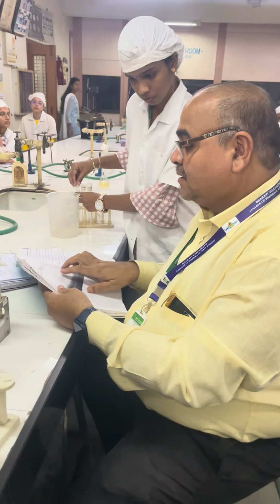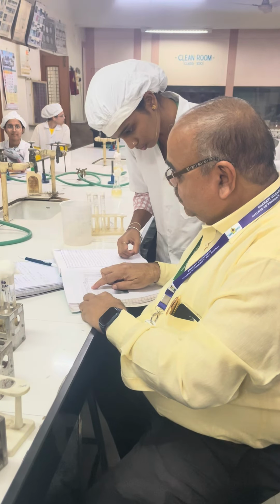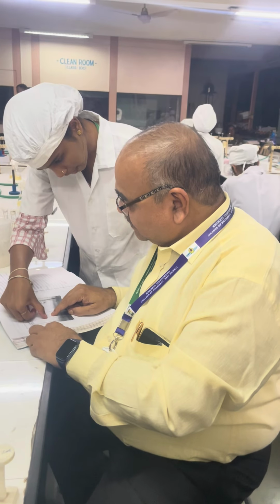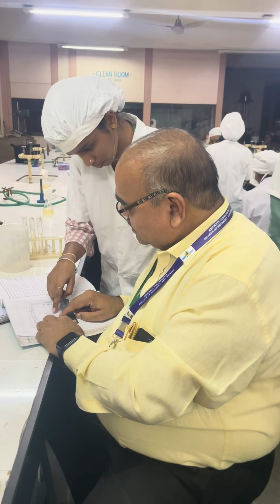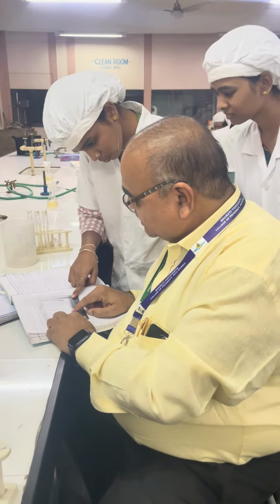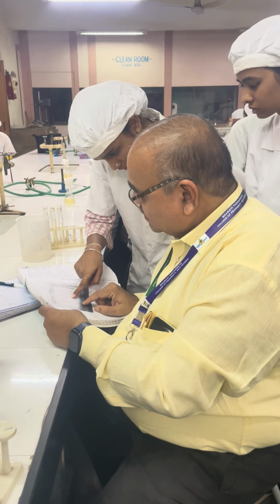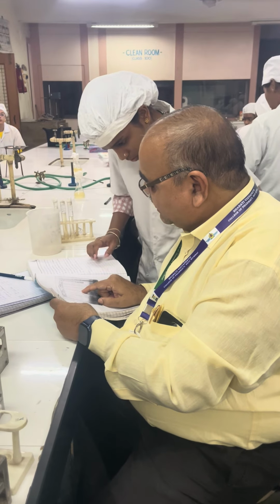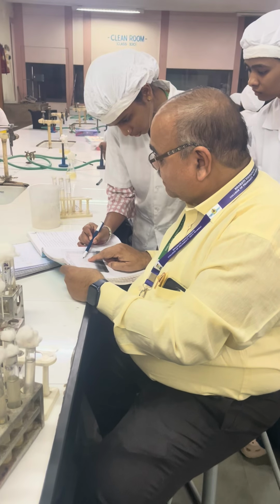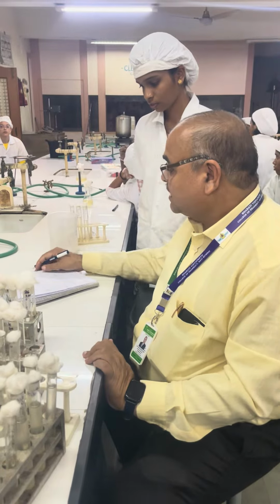See MPN here. 212. Where is this 212? This one. Yes. At 92.1. It is 211. This one is 222. This one is 22. So 212, 27. Yes, it is 27. You write 27. And this one is 322. Here, both waters are non-potable.